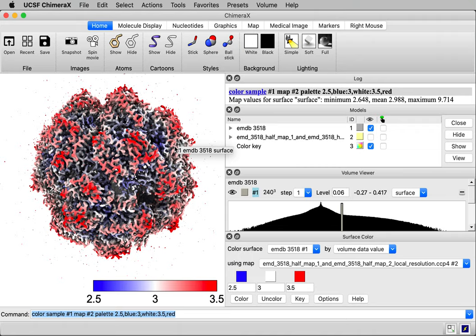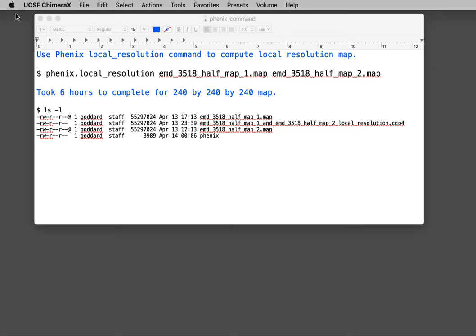ChimeraX doesn't compute this local resolution, so I'm going to use Phenix to do that. Let me show you the command.